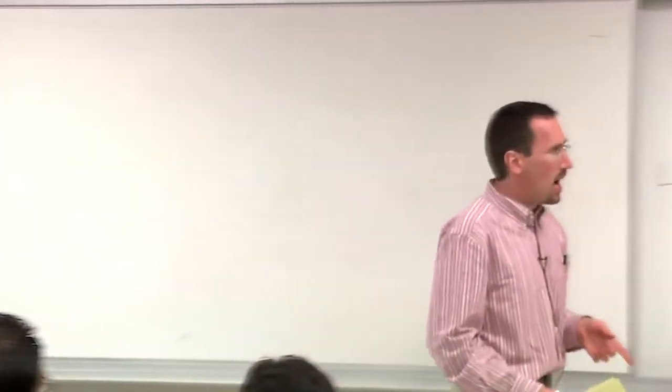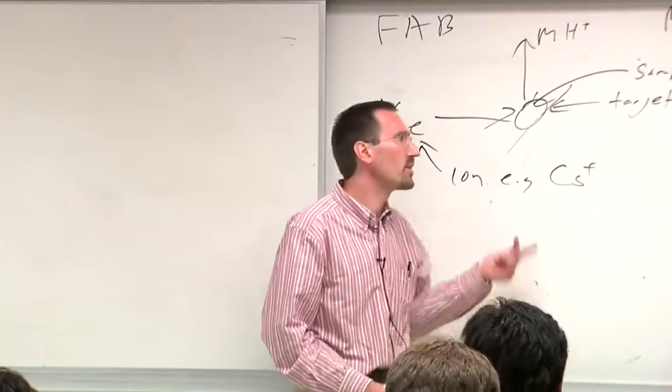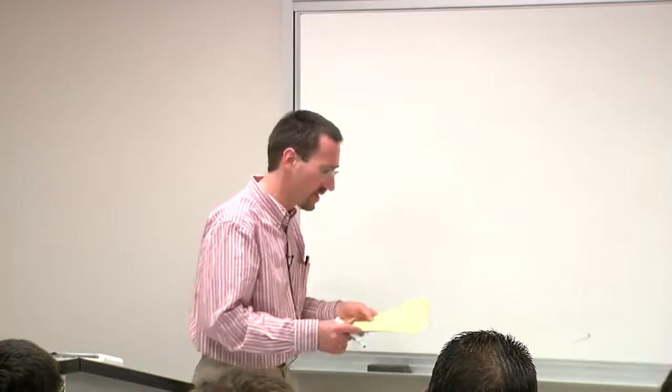All right, so does that change the type of detector you can use if the molecule's really big? It does. You can go with stronger magnetic fields, or I think typically this is done with a quadrupole. And then for MALDI, which I'll tell you about in a second, often people do time of flight because time of flight tolerates even bigger mass range.